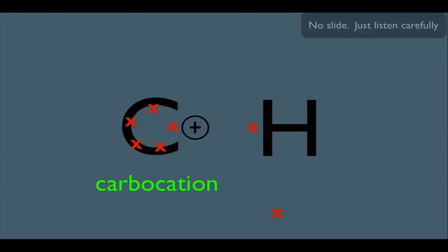Remember, when we shoot the electron beam at the molecule in the mass spec, both of these situations are possible. That is, hitting a core electron or hitting a bonding electron. And remember, since we're putting a whole bunch of these samples in the mass spec, each molecule is technically, quote-unquote, breaking differently. That is, some core electrons are being knocked out, some bonding electrons are being knocked out. It's all by random chance, and all we're studying here is the possible ways that this quote-unquote cookie can crumble.